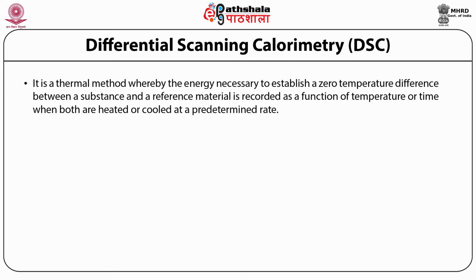The DSC curve is recorded with peaks indicating the transition temperature. The area of the peak measures the total energy transfer to or from the sample.